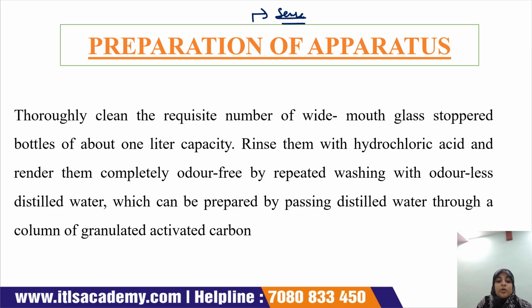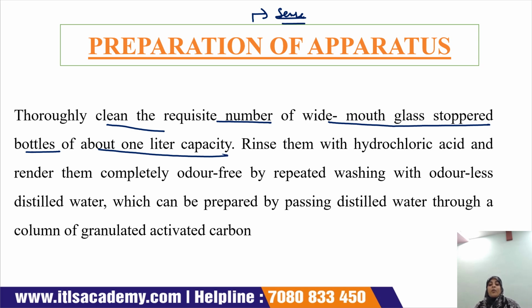Clean the requisite number of wide mouth glass stopper bottles of about 1 liter capacity. First of all, we take a wide mouth glass stopper bottle, and it should be cleaned by using hydrochloric acid.